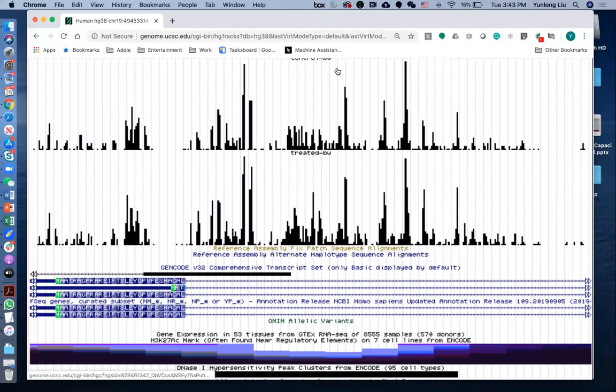So again, by summarizing, in these two lectures, or three in the past, I basically went through how to use the Genome Browser to visualize your own data. In summary, there are two elements. One is for small text files, you can prepare the files and directly load them into the Genome Browser. Another is that your pipeline will generate a binary format with specific requirements, and you also need to put that file on an HTTP server, get the link, and send that into the UCSC Genome Browser.